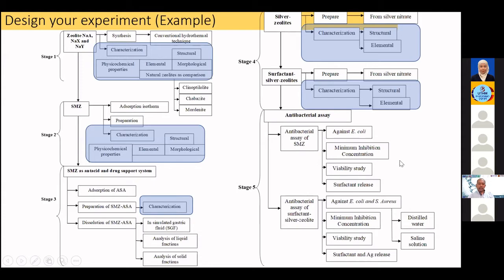Okay, so design your experiment. Don't just use these characterization tools to analyze the sample after you synthesize it, but also use them for the subsequent analysis.